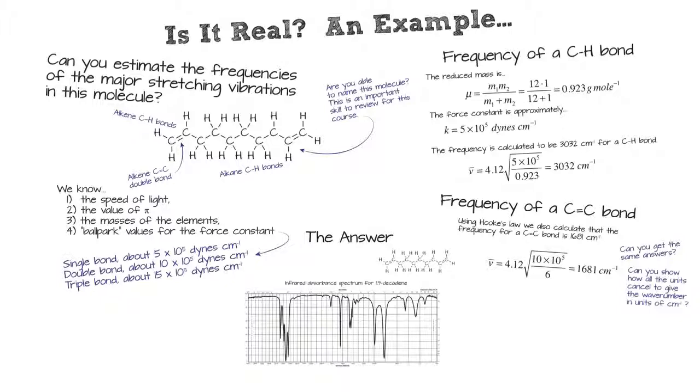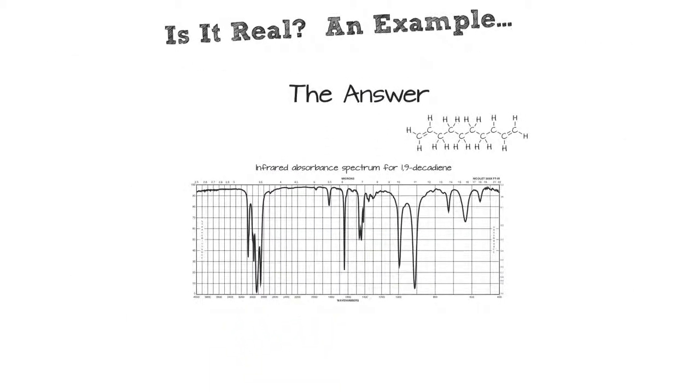Can we find some frequencies that relate to the carbon-hydrogen frequencies and the carbon-carbon frequencies we just talked about? Well, let's see. That is the number there for 3,000, and it's right in the middle of the forest of peaks that relate to CH stretches. Right away, you'll notice there's a lot of peaks just under, and a lot of peaks just over.